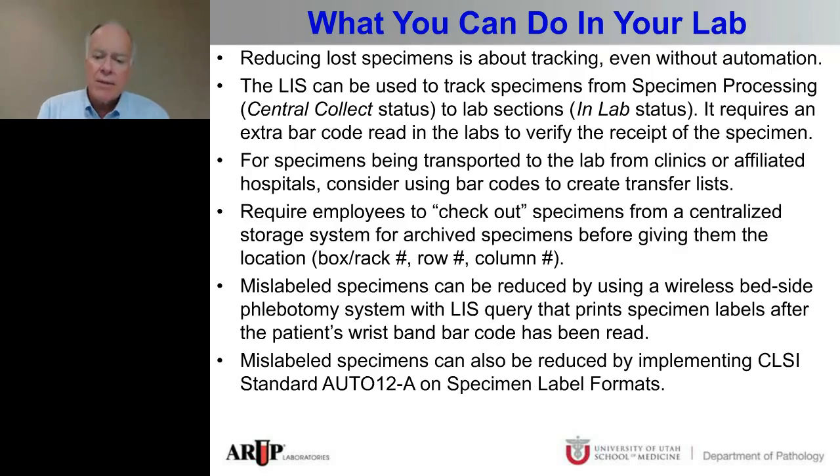We had that going on in our laboratory for a while until finally everybody got frustrated. I had said from the beginning, require employees to check the specimens out, and no one believed me. Finally, after several years, they took my advice, and we don't allow employees to get specimens without entering their ID. In fact, it's a barcode-based system, so they have to use their employee badge, which has a barcode. If you don't have your badge, you can't check out specimens.